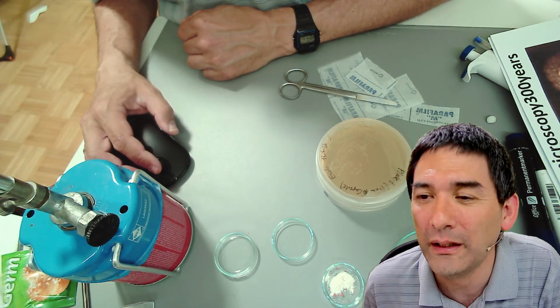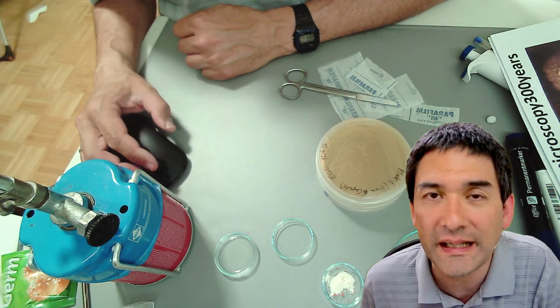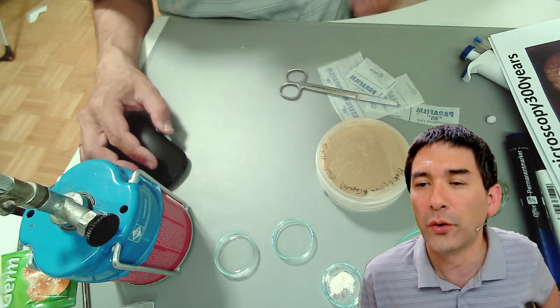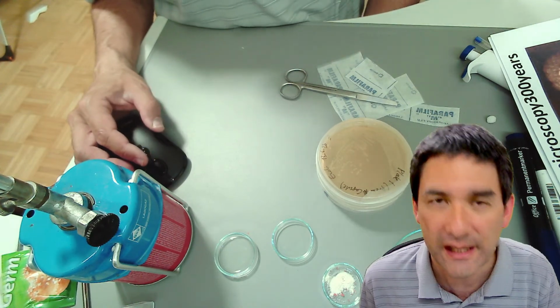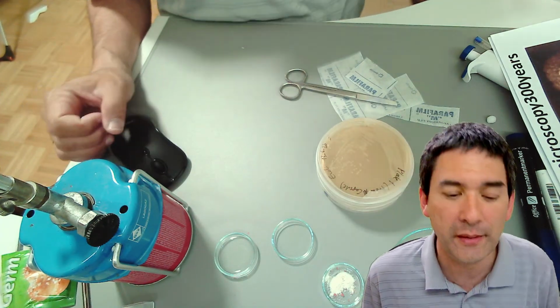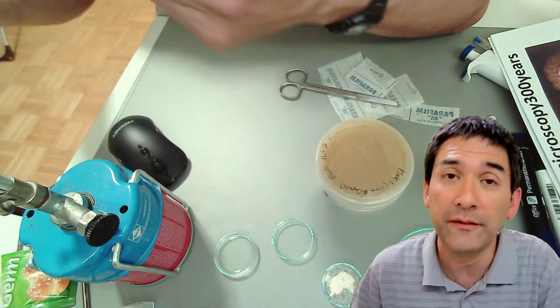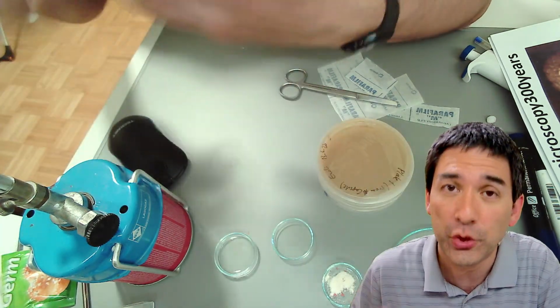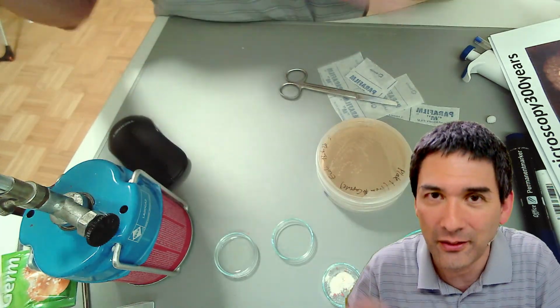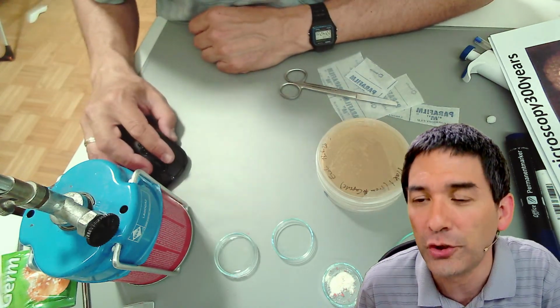Doesn't methylene blue kill the bacteria? Yes, it does, but they're actually already dead because they're heat fixed. Is it not used for throat infections? Yes, methylene blue can also be used to treat certain infections, and it is also used in some aquariums to treat fungal infections of fish. If the fish become ill, you can add some methylene blue into the fish tank, and then it also becomes blue, but this might actually help the fish.